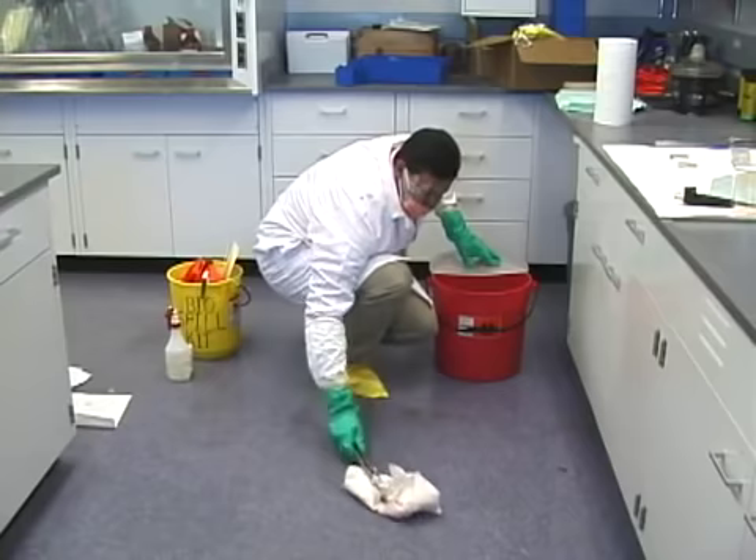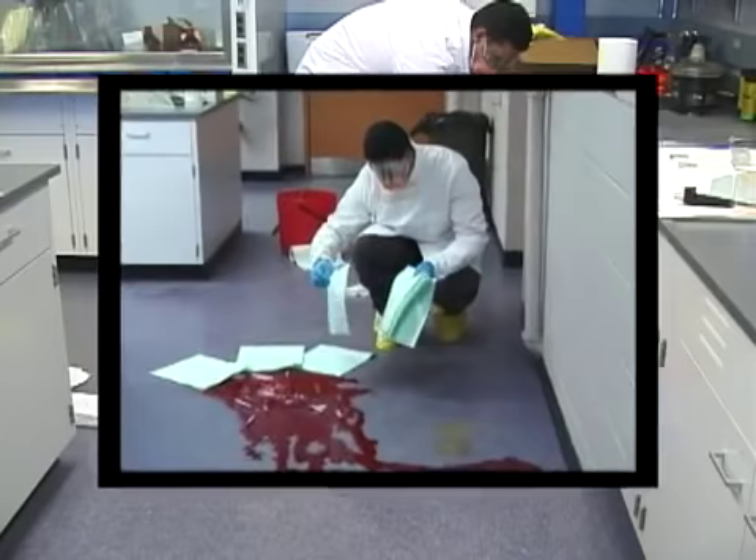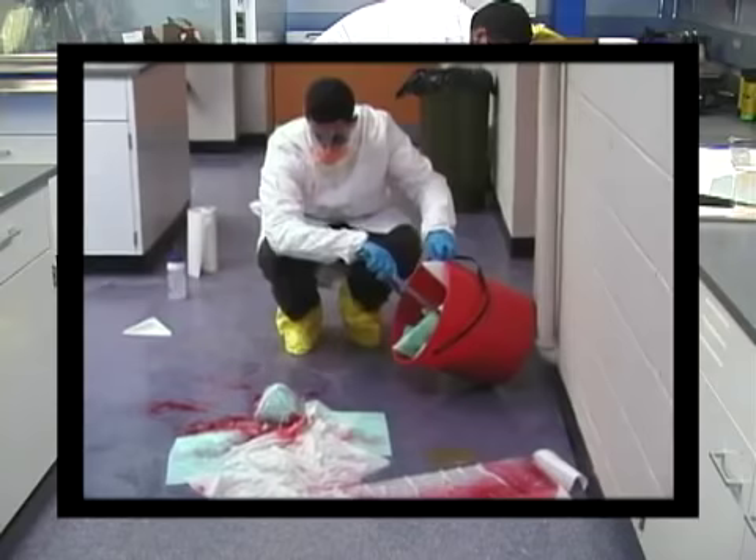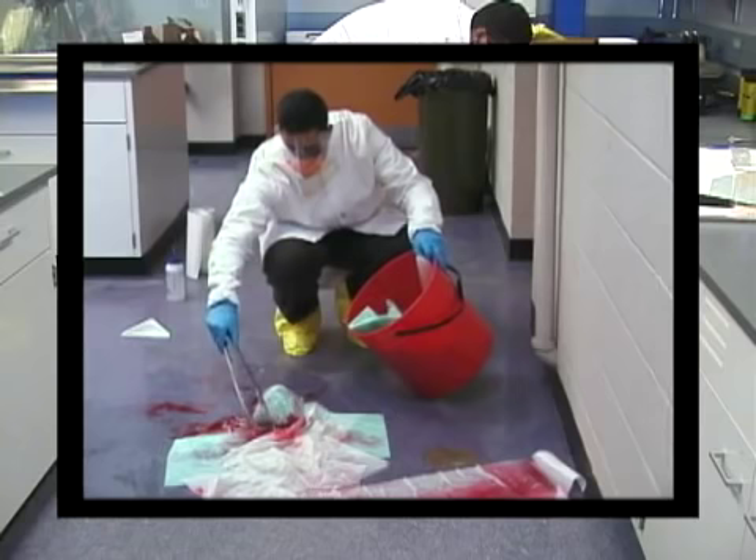Please note: if this was a high-risk blood spill or a spill of an infectious agent, the absorbent material would have been placed over the sharps, the disinfectant added, and sharps together with the absorbent material disposed of in a sharps container. This procedure decreases the risk of handling sharps prior to disinfection.